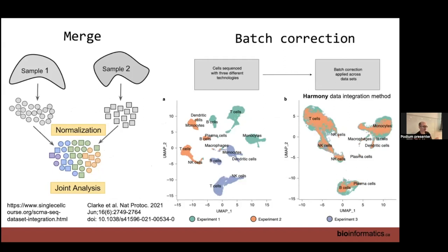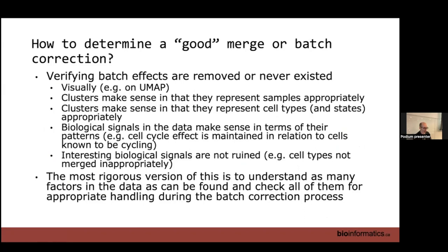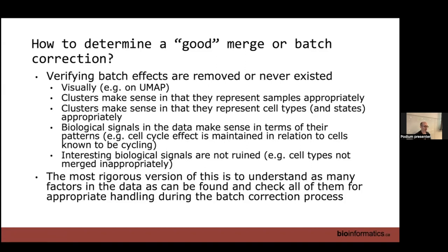Those are two real examples where we were able to just merge the data, which was appropriate for those datasets, but we had to prove it wasn't a systematic batch effect. So we have two options: merge the data or actually do see a big technical batch effect and need to do batch correction. Once we do batch correction, how do we know there's no remaining batch effect? One way is visually looking at the UMAP for big sample-specific differences. But we can also ask if the clusters we identify make sense in representing samples and cell types appropriately.